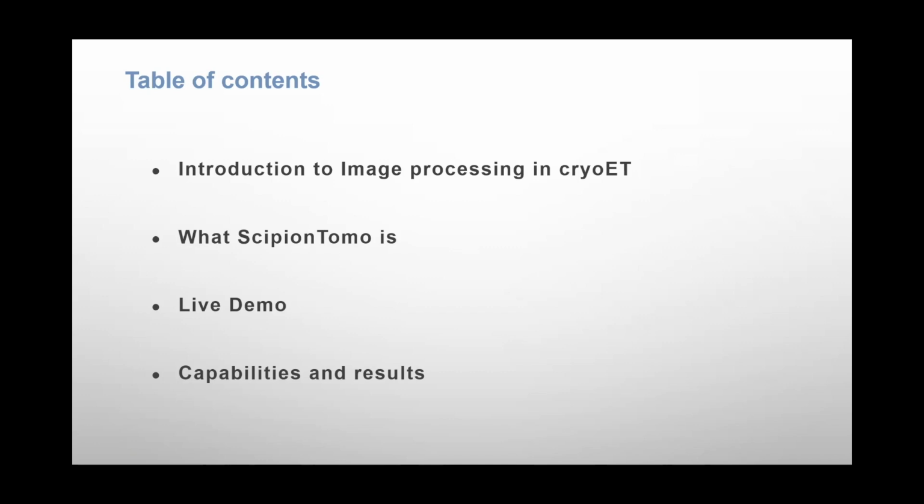So first, I will give a short introduction to cryo-electron tomography, which is a topic that we already know probably. Then I will introduce Scipion for tomography. We will carry out a live demonstration of this software. And finally, we will finish with some capabilities and results of the software.